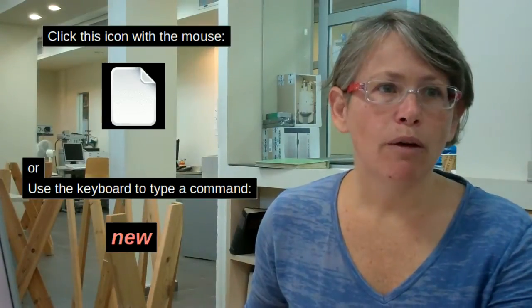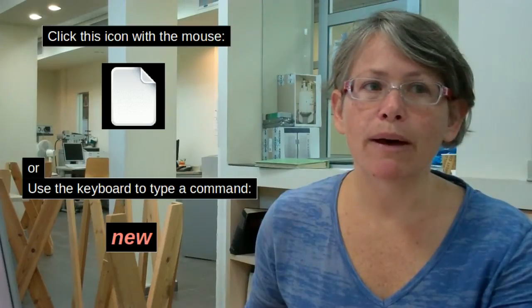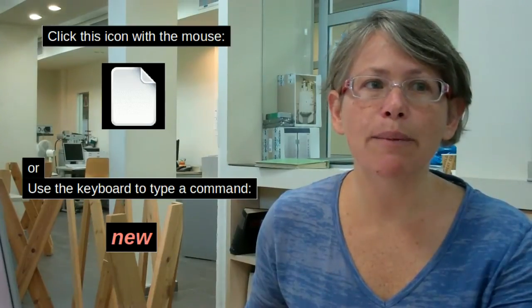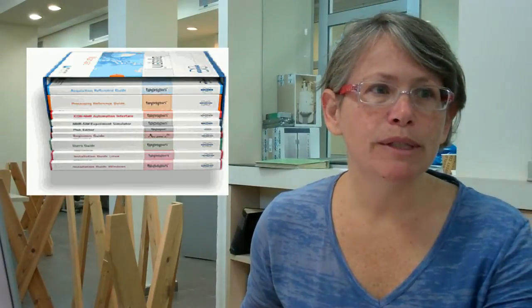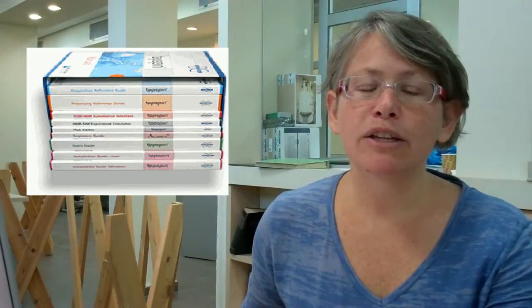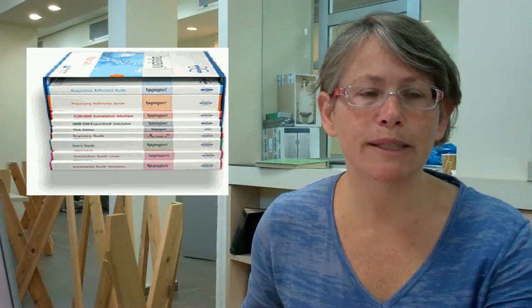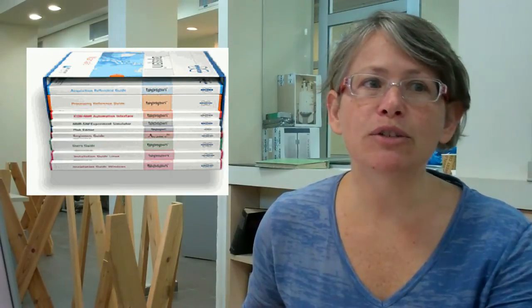The instructions generally include two options, one for the keyboard and one for the mouse. Online, you'll find hyperlinks with further details. You can find copies of our software manuals inside the lab, and you can use the help menu of the program since that's handy. However, the instructions that we will follow are sufficient for now.